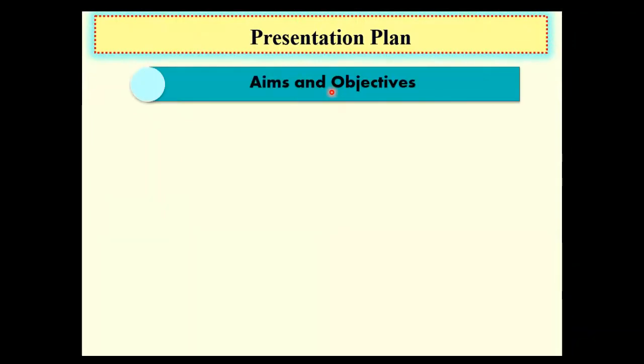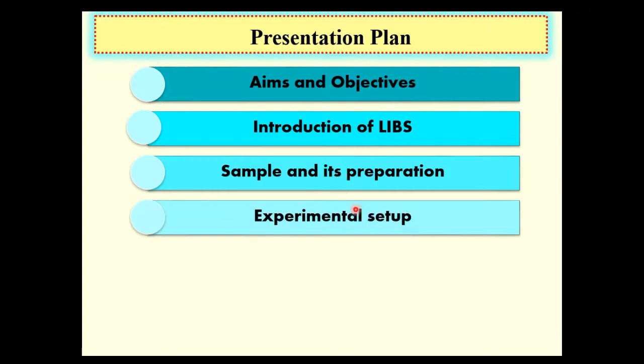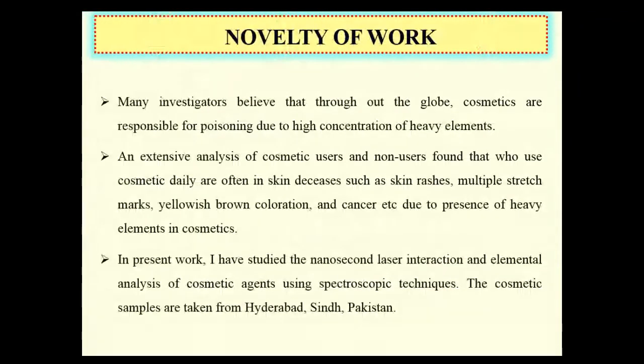Now presentation plan. My today's presentation plan consists of aims and objectives, introduction of LIBS, sample and its preparation, experimental setup, results and discussions, conclusion, and finally references. Aims and objectives. My aims and objectives are to study the nanosecond laser interaction with cosmetic agents, to find out the trace elements in the cosmetic agents, to study the hydrodynamic variations of emission line with a delay time, to study the plasma parameters such as electron temperature, electron number density, inverse bremsstrahlung coefficient, and plasma frequency, and to find out the concentration of trace elements present in cosmetic agents.